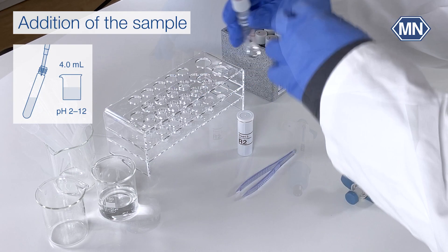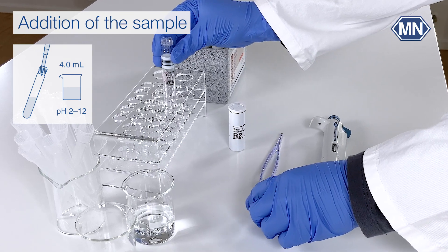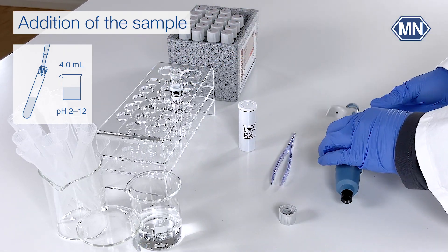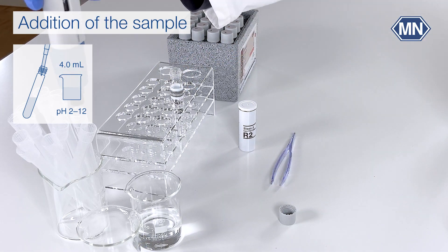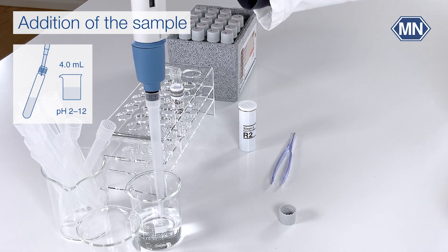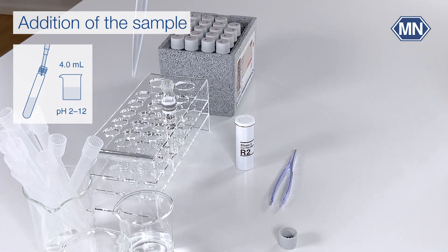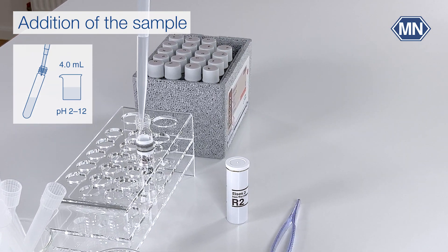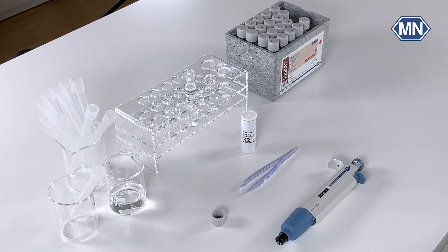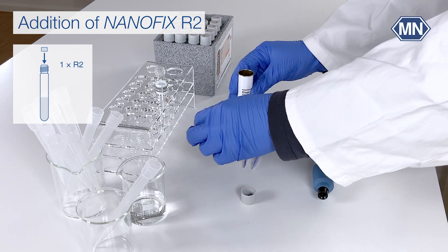Open the test tube. Take a pipette and add 4 milliliters of the sample to the test tube. Then add the Nanofix R2 with the tweezers.